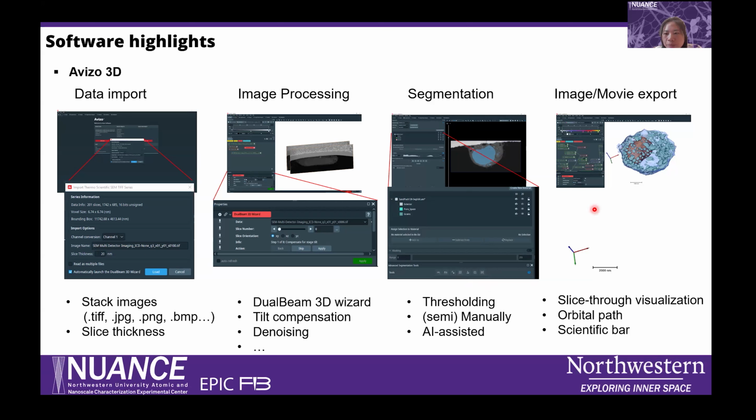And finally, you can visualize your 3D structure and export the image or movie to show the slice-through visualization, and it can rotate and move around a specific orbital path, and you can add scale bars on the movie.